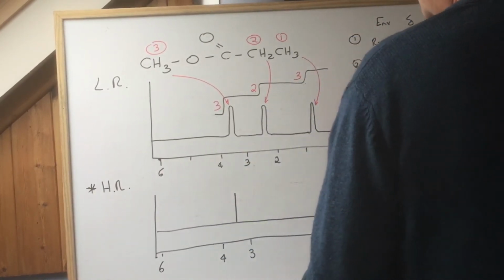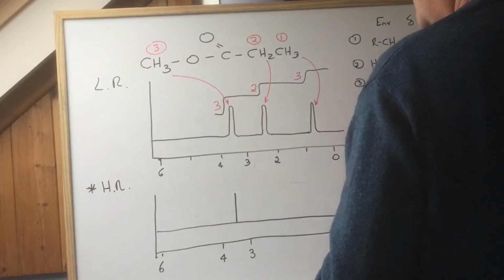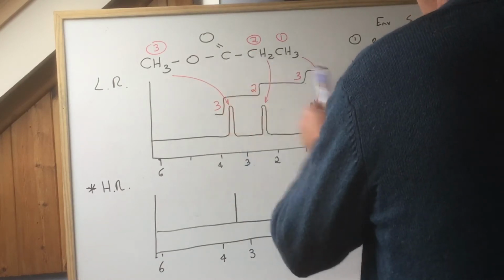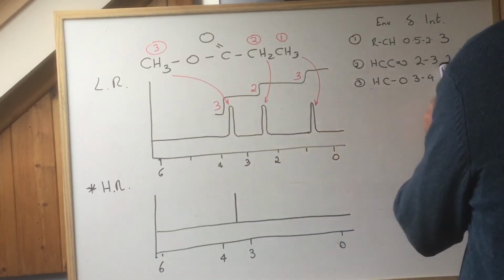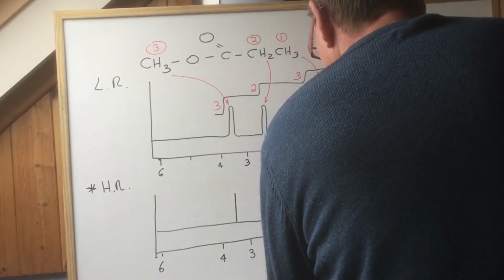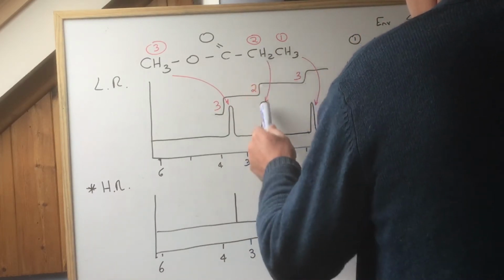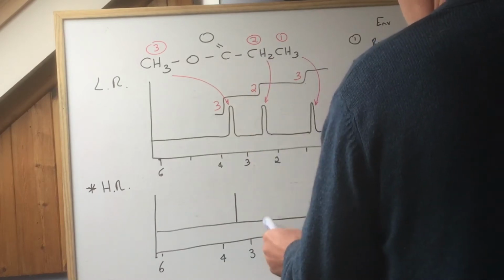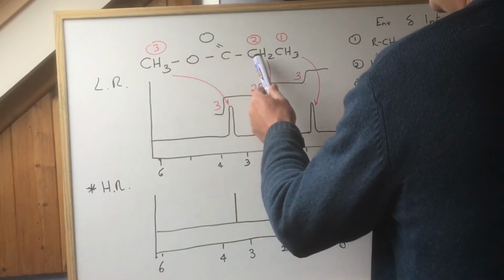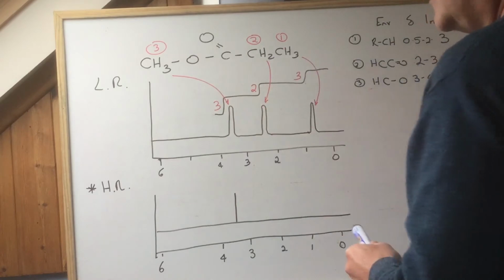Okay, now let's go to the business end. Here, 2 protons on a carbon. In that environment, everything's sorted. There it is, look. I should put a 2 there and a 1 there. Right, so those 2, are they going to be split? Is there an adjacent carbon? Yes, there's 2. There's an adjacent carbon there and there's an adjacent carbon there.